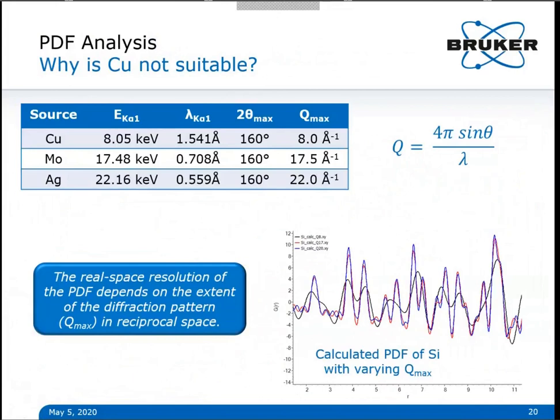So here we try to illustrate why this is not a good idea to do with copper. Essentially, a PDF coming from copper will have very broad peaks and some additional artifacts that make it difficult to do a proper analysis of the PDF pattern. So the short answer is no, it's not really suitable for that.